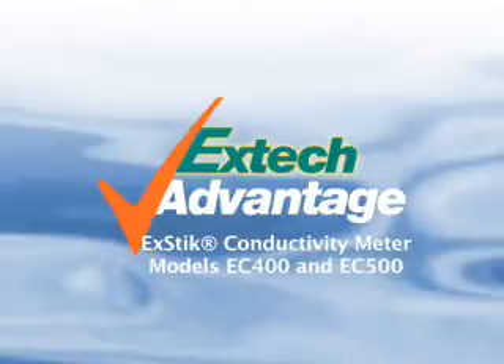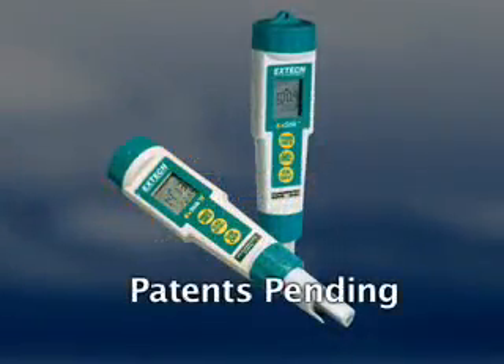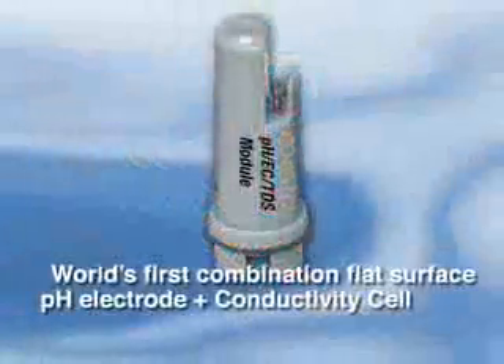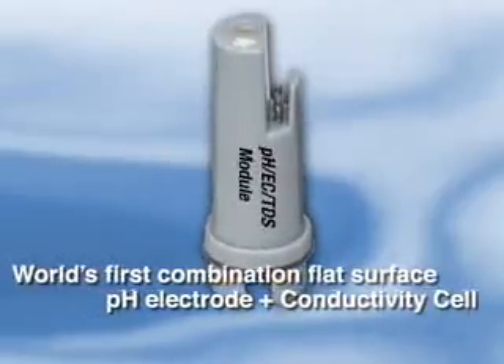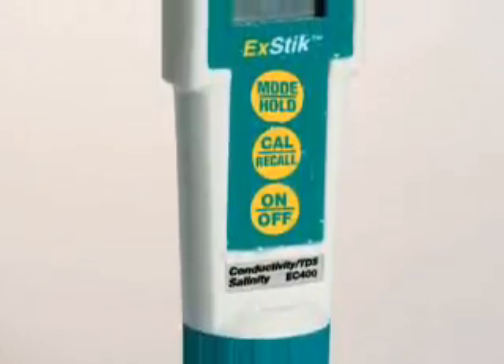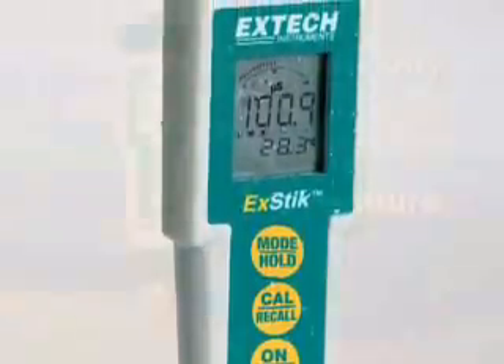Discover the simplicity of multi-parameter EXTEC2 conductivity meters designed with an auto-ranging combination electrode. EXTEC is the first to develop the combination flat surface pH electrode with built-in high-accuracy conductivity cell. These advanced auto-ranging sensors offer you convenience in measuring more than one parameter without having to carry multiple meters or electrodes.